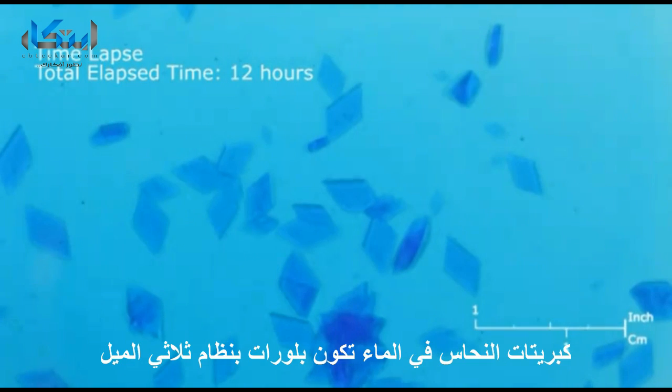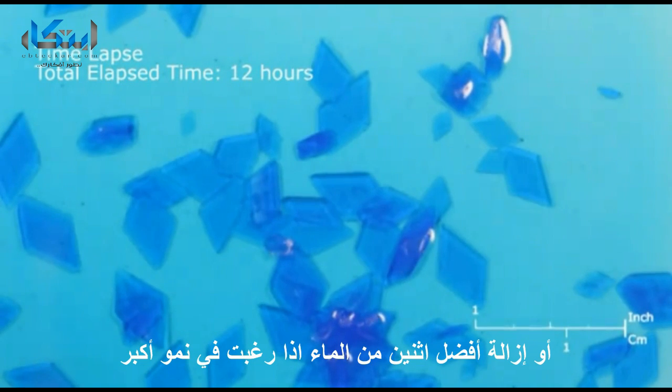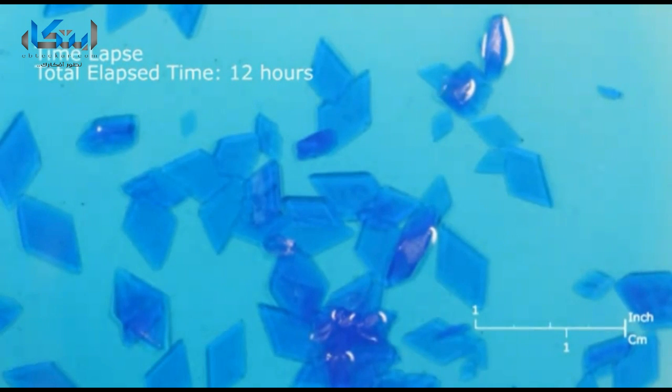Copper sulfate in water forms triclinic crystals of copper sulfate pentahydrate. You can grow several small crystals, or you can remove all but one or two of the crystals if you want better growth. When you are satisfied with your crystals, you may remove them from the solution and examine them.